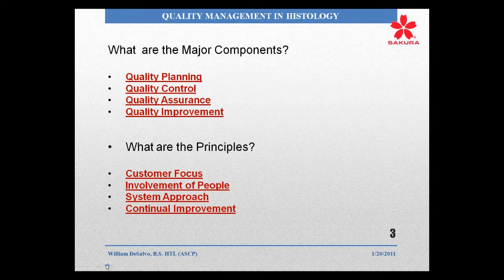You've probably heard a lot about that, but it really is focusing everything that you do on what the customer really wants. And sometimes you have to ask the customer. One of the difficulties in histology, though, with customer focus is that we're not fortunate enough to have just one customer. We will have multiple customers. Typically, your pathologist is your first customer, but then you have clinicians, surgeons, and certainly the patient.